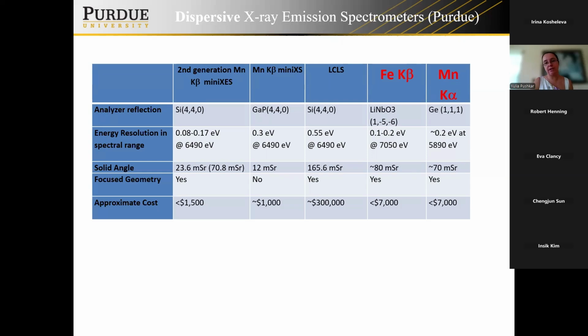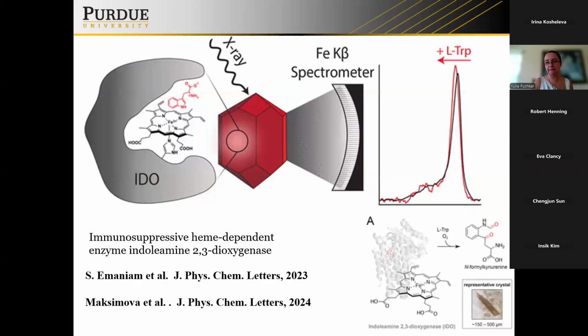As for biological applications, the iron K beta spectrometer was very much motivated by biological applications, even starting from some controversies in myoglobin, hemoglobin, and tons of iron-based oxidation enzymes. So I think the space for iron-based chemistry analysis is enormous. We only did this one demonstration, which was also done at APS, not at BioCARS, but at the ID beamline. I believe it was sector 20, in collaboration again with Kate Davis's group.